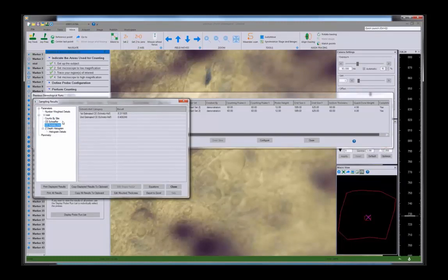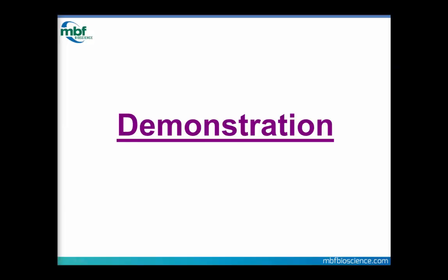Here's the Z depth histogram. It bins the Z of that 20 microns of the section, and it shows you where you counted your markers, and this can help you set your guard zone. The bottom line here is we need more than 6, but use the number weighted section thickness estimate to get your estimate of the number of cells.